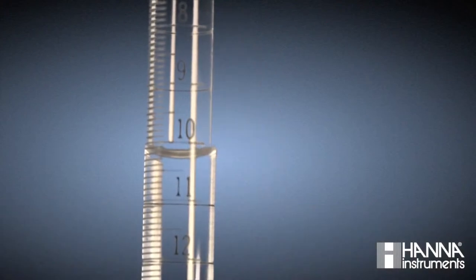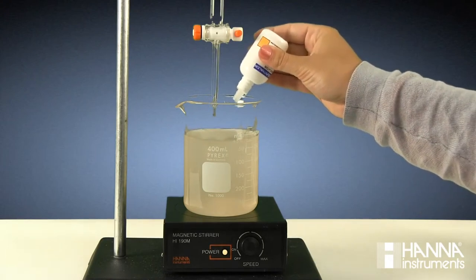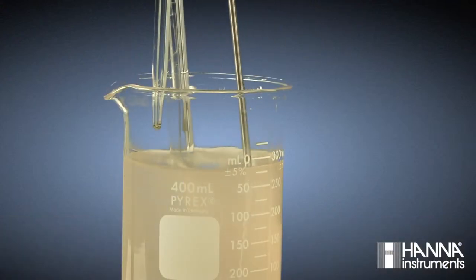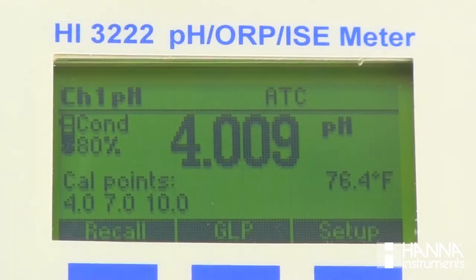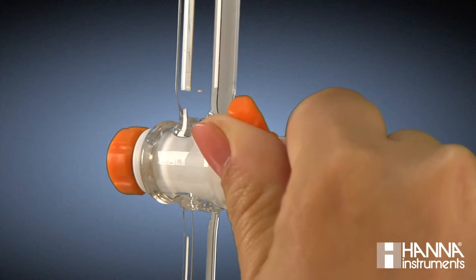Reading our meniscus, we record that our starting volume for titrant is 11.62 milliliters. Once we have our sample stirring, we add four drops of our color indicator phenolphthalein. We immerse our temperature probe and our pH electrode in the solution, making sure the reference junction is submerged. We observe that our starting pH is just above four. Now we can open the stopcock and begin dosing our titrant into the sample.